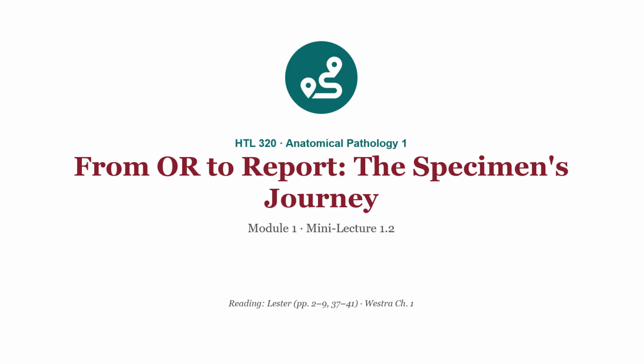In the last mini lecture, we said that correct specimen handling is what makes an accurate diagnosis possible. Now, let's make that concrete by following a single specimen on its journey, from the moment it leaves the patient in the operating room all the way to the signed pathology report. My goal is that by the end of this lecture, you can name every major step in that journey and, more importantly, see exactly where your work as a histotechnician fits into it.